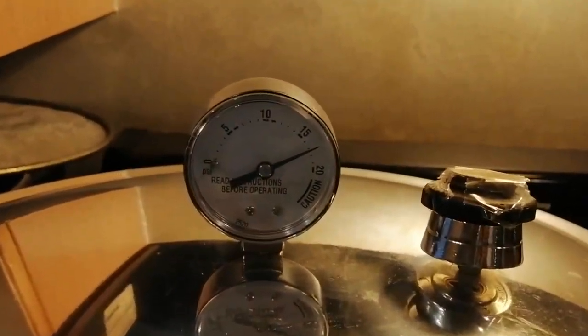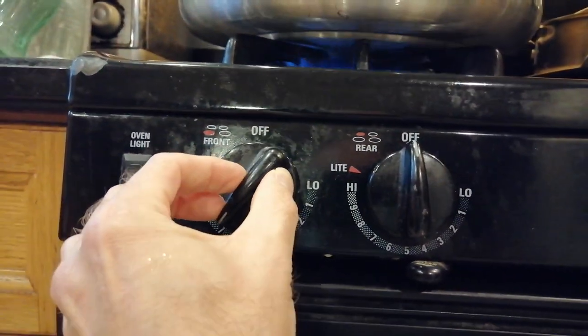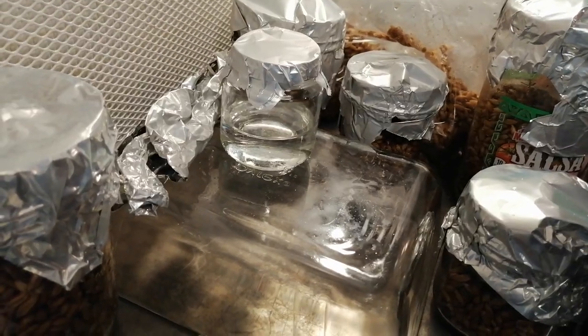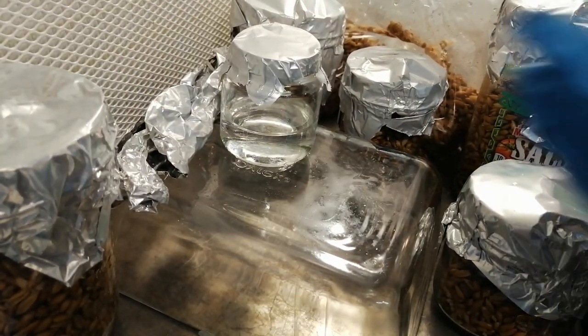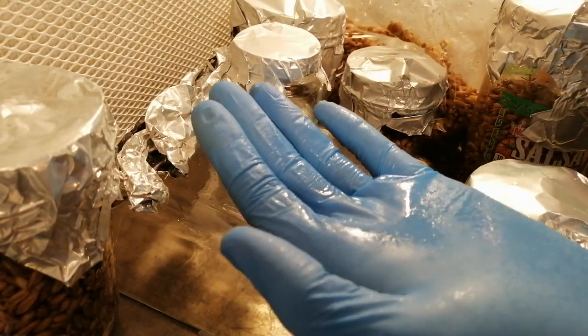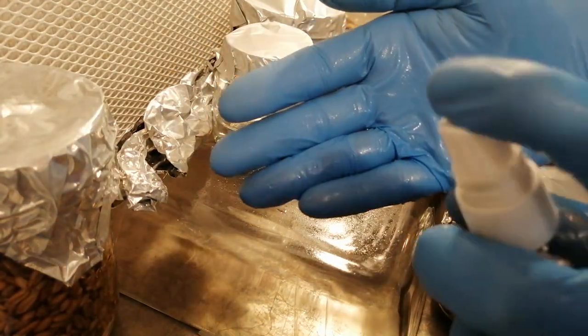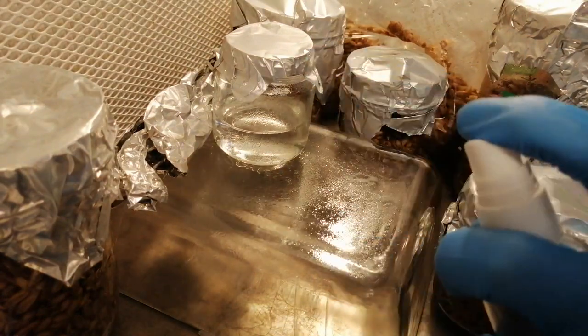After the pressure has built up to 17 psi, you can turn the heat down. Then set a timer for 45 minutes. After the 45 minutes, you should wait for everything to cool down first — this could take several hours — then move all of the contents of the sterilizer to your still air box or flow hood. I'll be using a flow hood in this video, but I did show how to make and use a still air box in a prior video. I'll put a link to that in the video description.